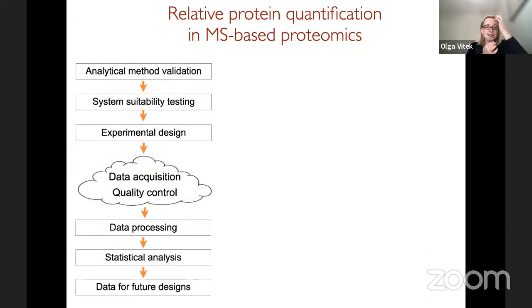So this is a typical data processing workflow in MSstats from a statistician's perspective. Oftentimes when people focus on proteomics and data acquisition, there will be a lot of steps of sample processing, sample handling, data acquisition, and then there's a little box, data analysis. So statisticians think about this in the opposite way. There is quite a bit that has to happen before we collect the data, and as much has to happen after we collect the data. And of course, data collection is in the middle.